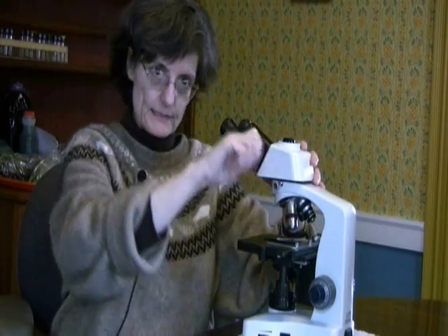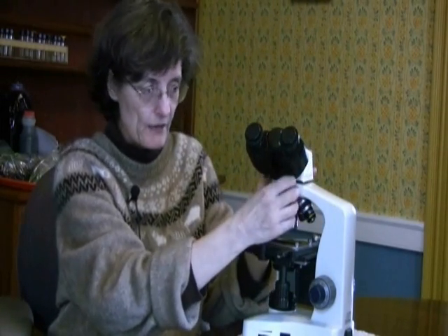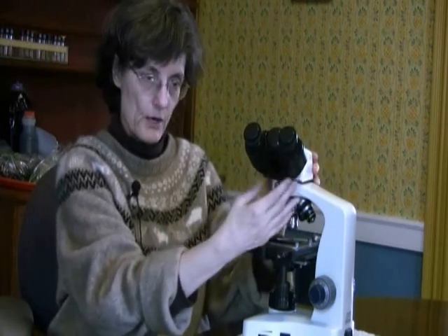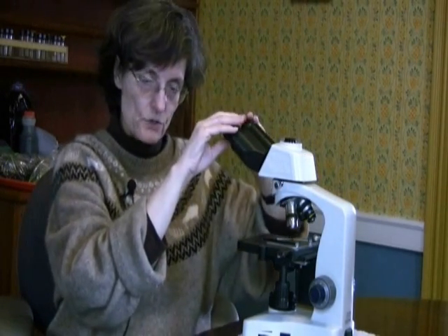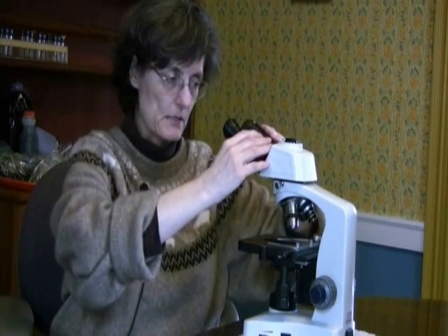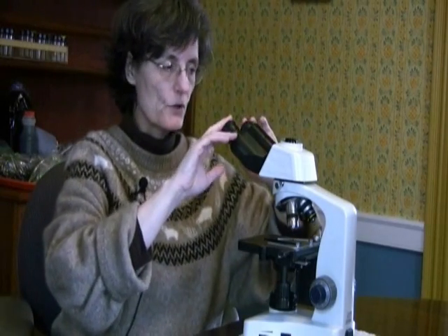Now, don't tighten it so hard that you rip the threads, because you're going to want to be able to loosen this up in case you want to show somebody else something without having to move your microscope. You're going to want to be able to loosen this just a little bit so it can move back and forth. These are where your eyepieces are going to go, and you have covers to protect and prevent dust and dirt and anything else moving inside your eyepieces. So make sure that those have covers on them. Whenever you store it away, make sure those covers go back on.